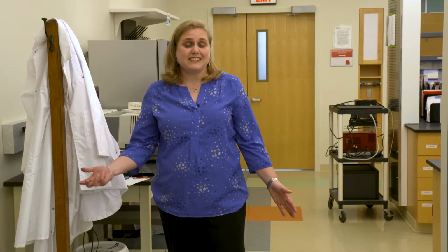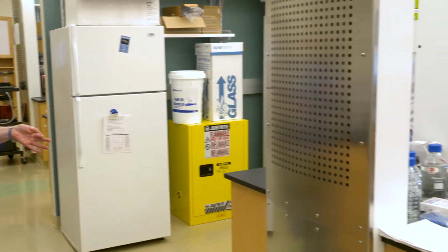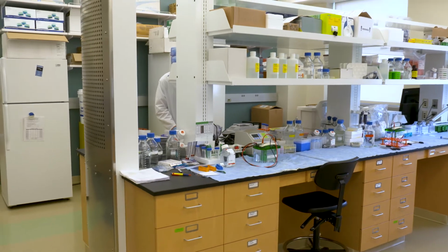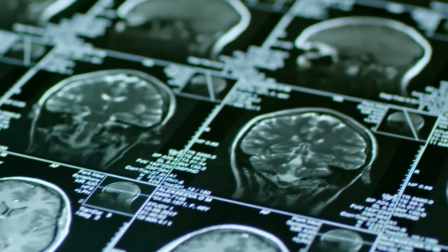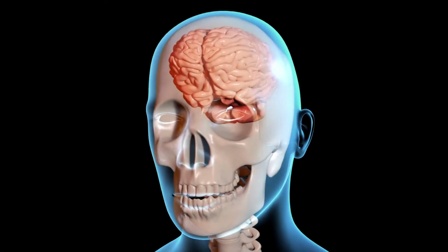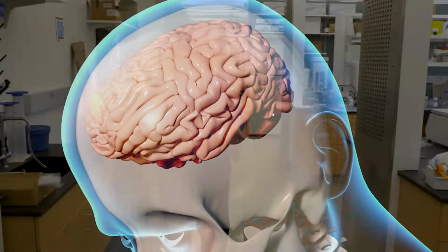One of the great things about Morrison is we have this nice open lab space. And so we're now walking from the Iverson lab into the Kievit lab. Dr. Forrest Kievit is in charge of this section of the lab. He is also a professor in biological systems engineering, focusing on biomedical engineering. His lab uses nanoparticles that are sensitive in an MRI, and they are using it to learn about traumatic brain injury. There's so much we don't know right now about traumatic brain injury and how the damage that happens in a moment can progress over time. They are developing these nanoparticles to help us learn about it and treat traumatic brain injury as we go forward.